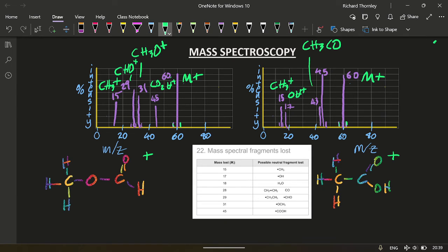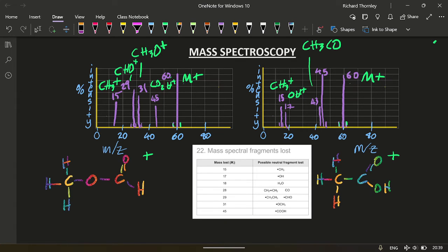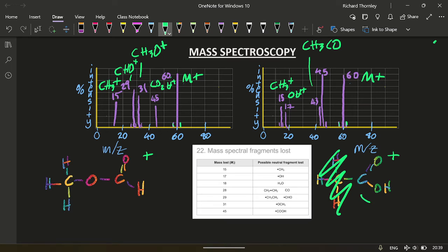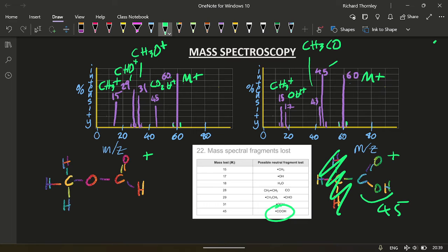And 45, well, that's going to lose a 15, isn't it? The difference between that and that is 15. So that means that's gone and left me with 45 here. Yep. Confirmed down there. So that's 45 is CO2H. And again, make sure you've got those pluses.